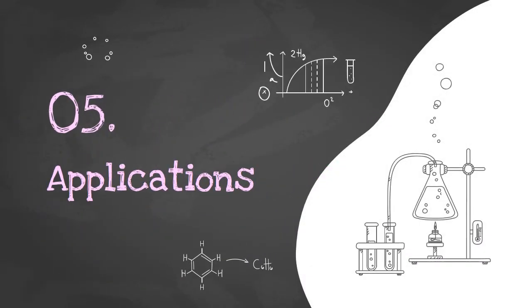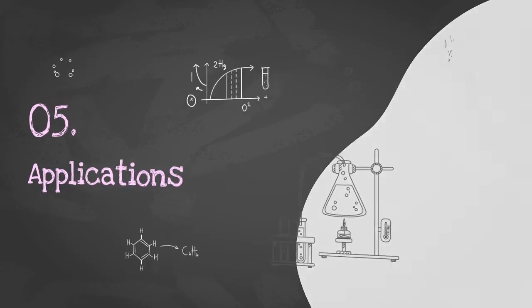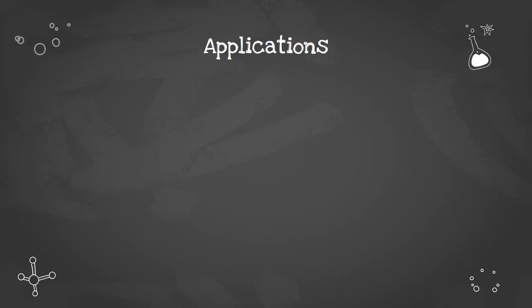Now, let's discuss the applications of GC. The list of gas chromatographic applications is very extensive. The following is an example list of applications.